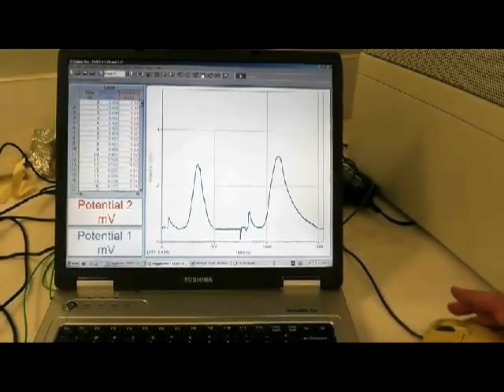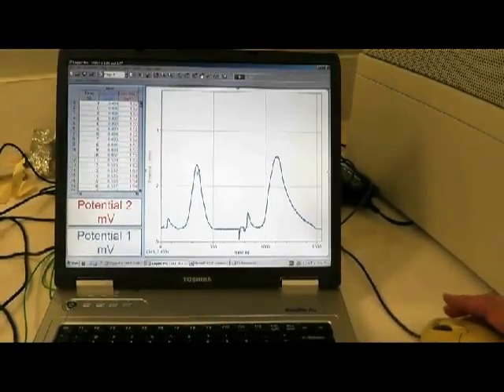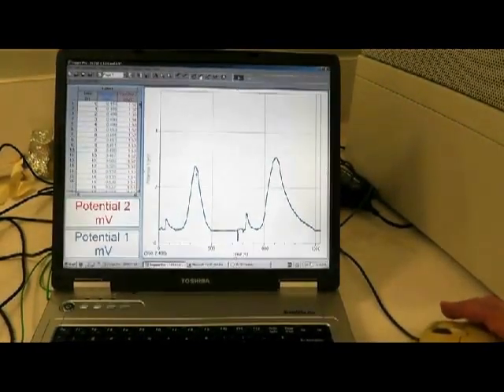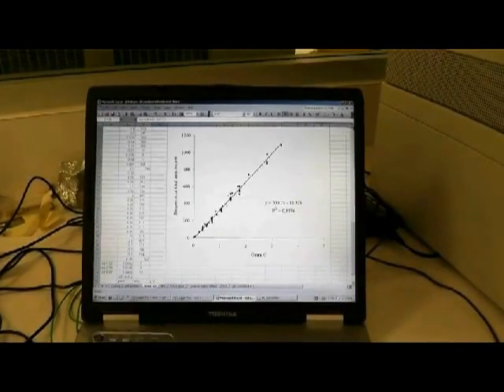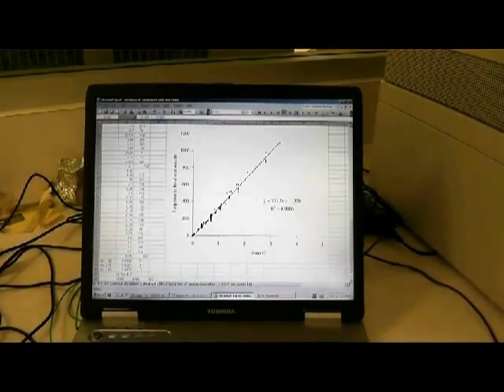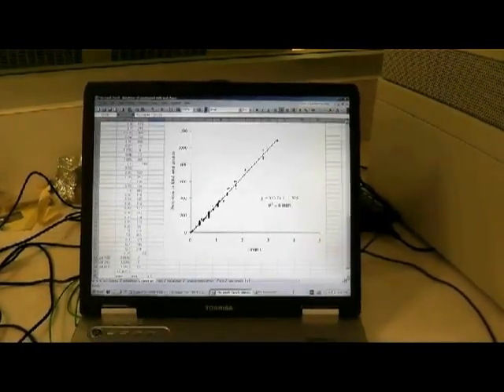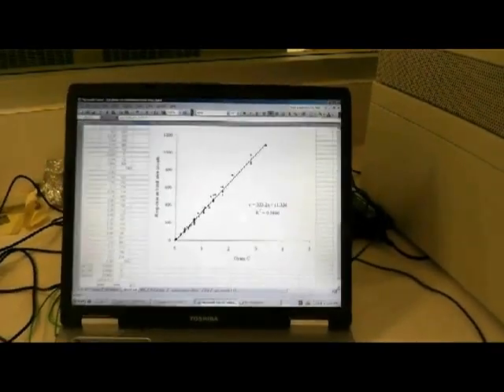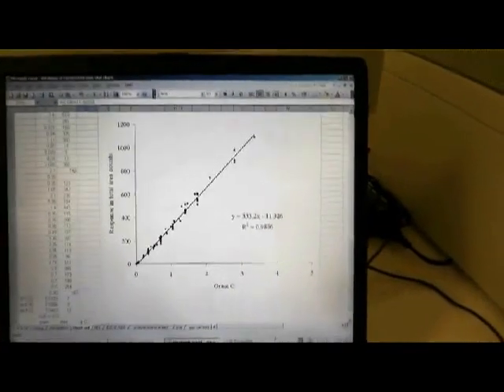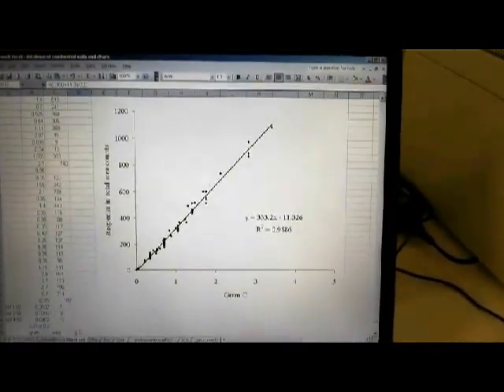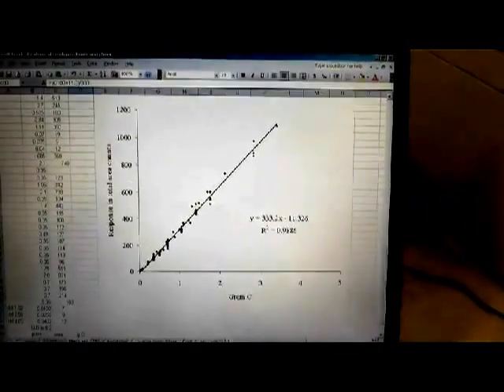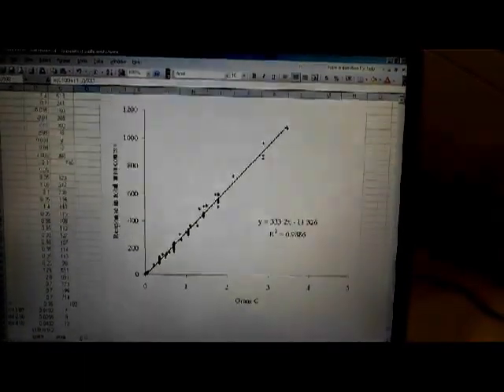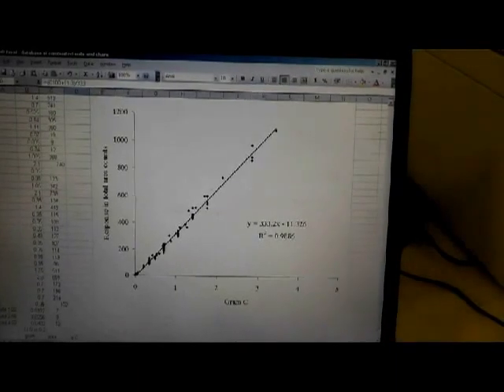The area of this peak is proportional to the amount of carbon in the organic matter within the core. We take the areas and input them into a spreadsheet. They form a calibration if we are using known amounts of carbon. Or we simply read off how much carbon is in the core based on the function derived from the calibration chart.